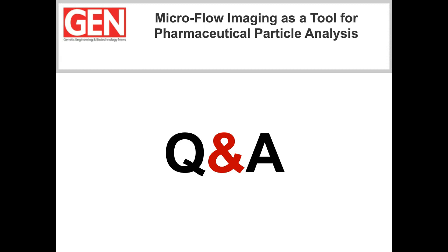So another difference I would like to mention is that MFI can measure in a more limited size range. The MFI instrument that we have been using measures in the size range of 2 micrometer up to 300 micrometer, whereas the Mastersizer measures in the size range of 20 nanometer up to 2 millimeters. So size range is definitely a limitation, but if your product falls in the right size range, it works perfect.